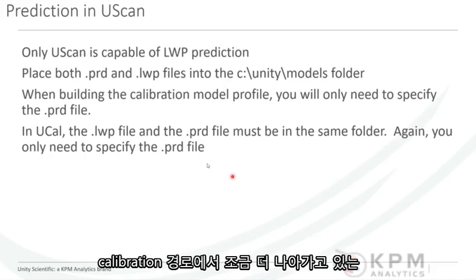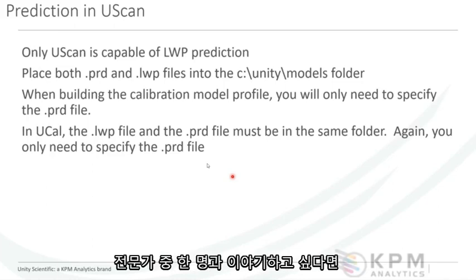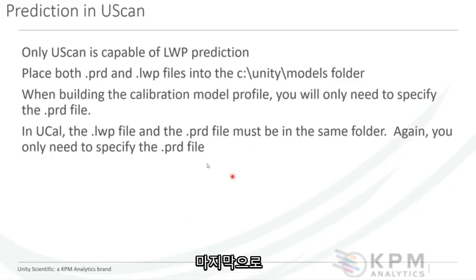So I would encourage those of you that are a little bit further in the calibration path to take a look at locally weighted predictions. This is also one of these areas that is outside of building a simple quantitative model. And if you'd like to talk to one of our experts, please contact me or your KPM Unity product specialist.